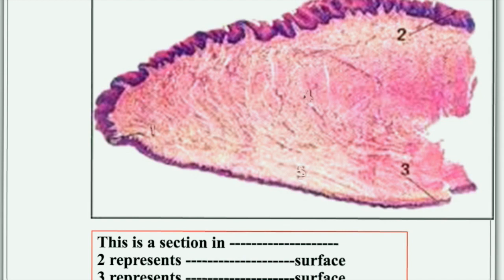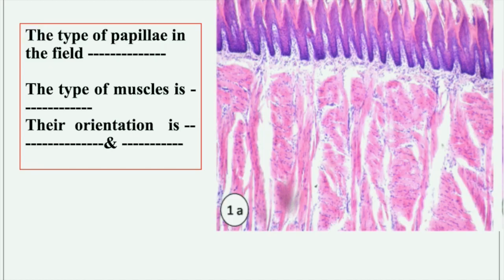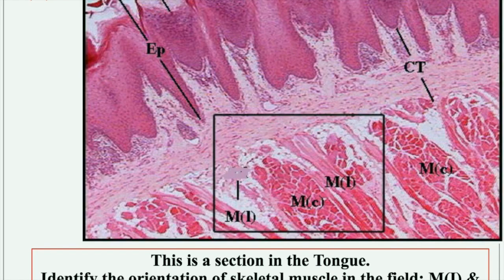This is a section in the tongue. Label two represents the dorsal surface, characterized by the papillae, and label three represents the ventral surface, which has no papillae compared to the dorsal surface. A label on the central mass indicates the skeletal muscle of the tongue. The filiform papillae are the only type covered by keratin and the only type devoid of taste buds. The muscle orientation is vertical and transverse: ML is vertical, MC is transverse.